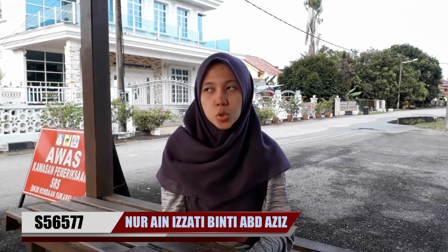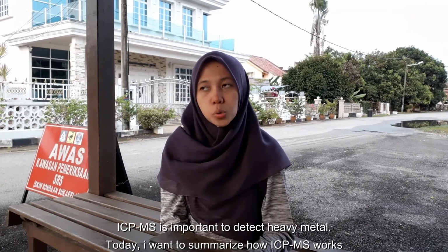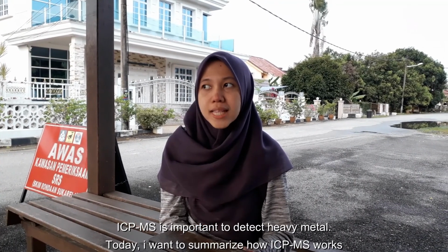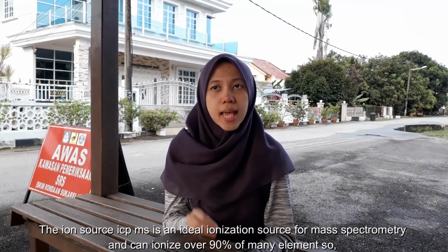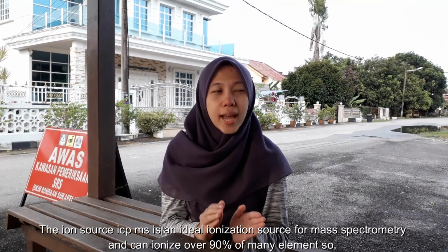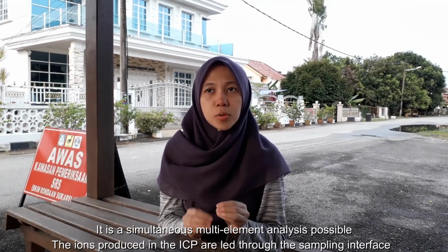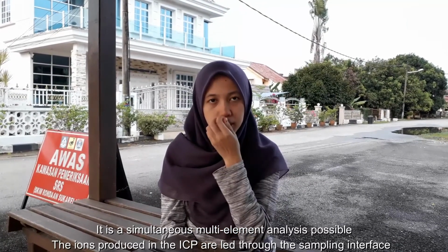Hi, today I want to share with you the instrument I chose, which is ICP-MS. ICP-MS is important for detecting heavy metals. Today I want to summarize how ICP-MS works. The ion source, ICP, is an ideal ionization source for mass spectrometry and can ionize over 90% of many elements, so simultaneous multi-element analysis is possible.